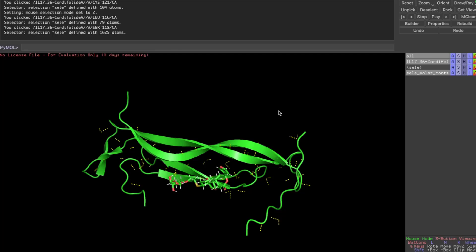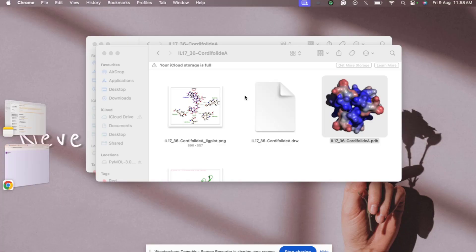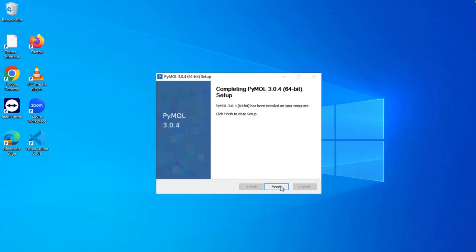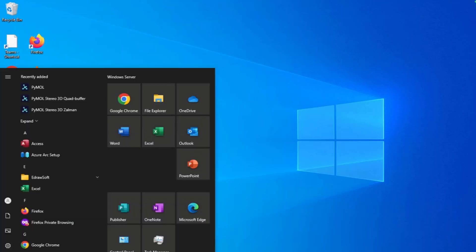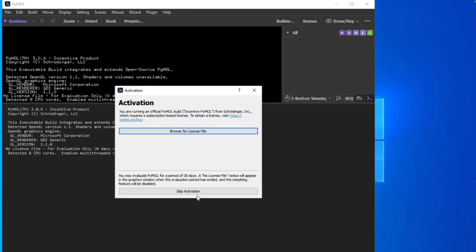You can go to Select > Find > Polar Contacts within selection to analyze interactions. Today's demonstration focuses on installation and the UI, not detailed analysis. Now, back to Windows — the installation is finished. Click Next, then Finish. A desktop icon is created, and typing 'pymol' in the search shows the newly installed version.